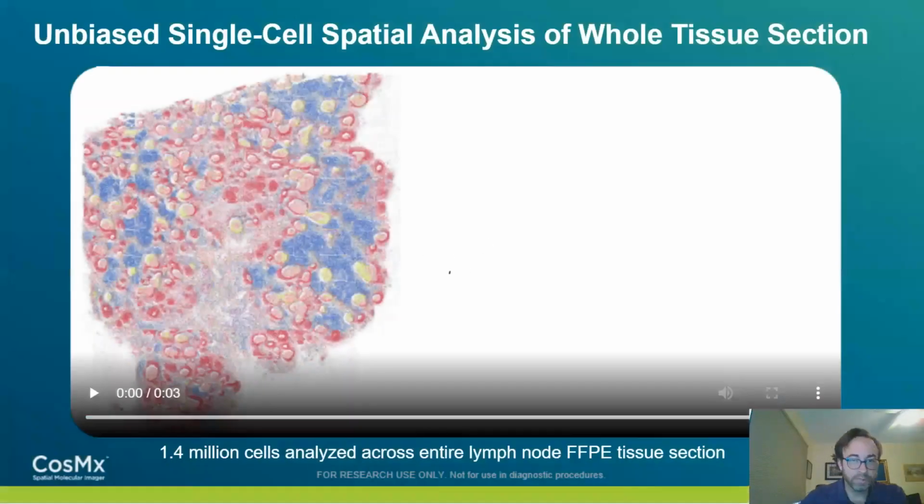Now, I also want to emphasize that the other piece of this, when you've got a tissue structure like this, you can basically get the cell types for free. The reason that you get the cell types for free is because we're working in a space similar to what you have with single-cell-seq. You have data that is physically resolved, but you also have data that's coming directly from transcriptomics, and so you can run the same types of analyses that you would with single-cell sequencing.